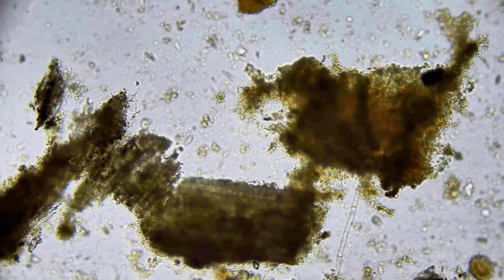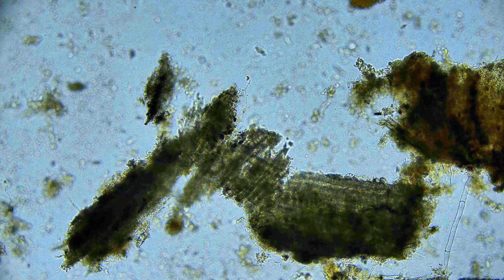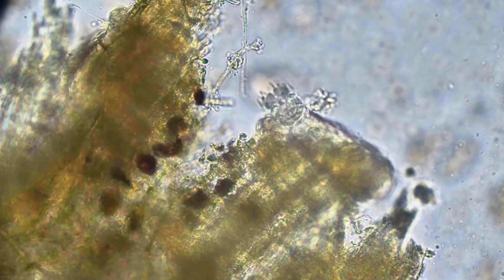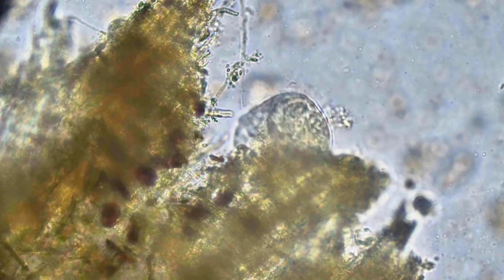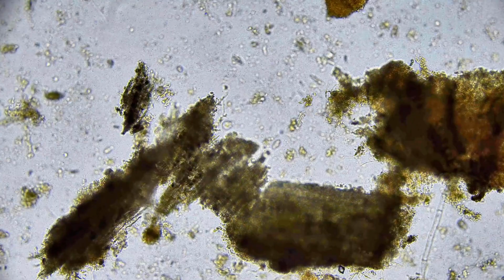Where'd the rotifer go? Let's show him a little love. He's down here working. These rotifers are amazing, and I'm going to do a lot more research on them as I learn and grow them out. But they're absolute shredders. They are junk collectors. Look how hard they work. They're just cleaning it up, taking in bacteria and creating life. They move like that. They crawl. They can fly. They can flat out fly across the slide. It's always fun to see that.